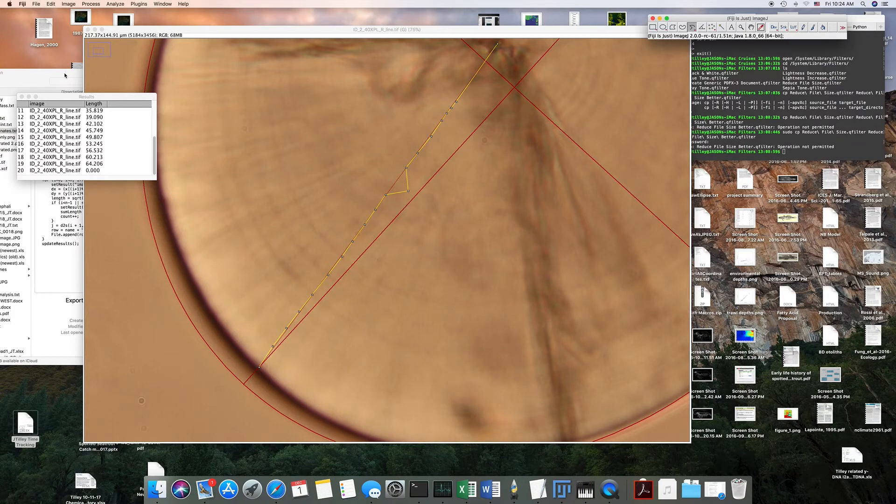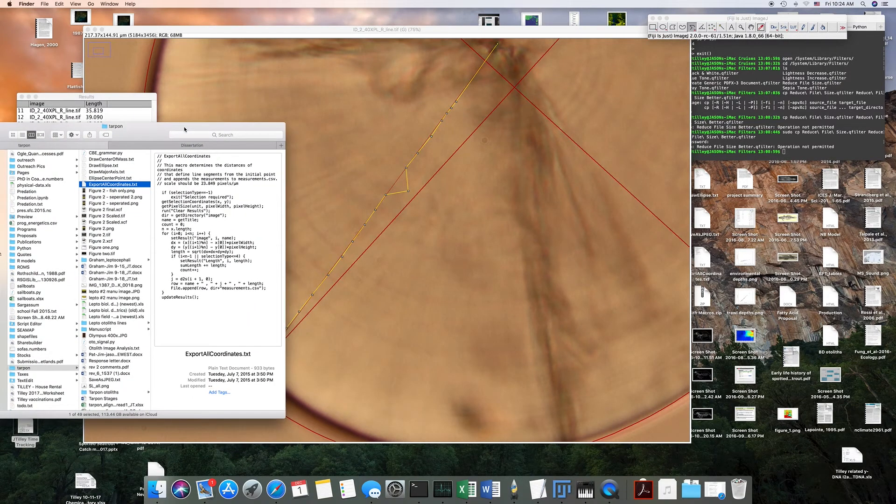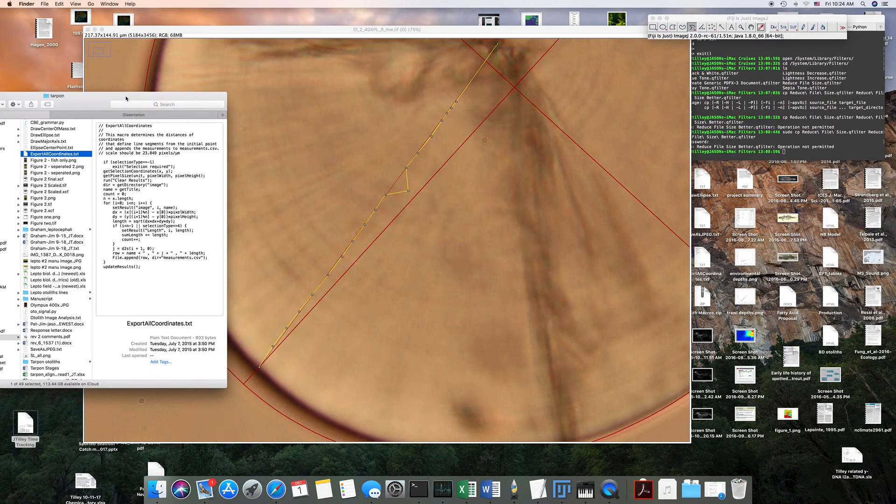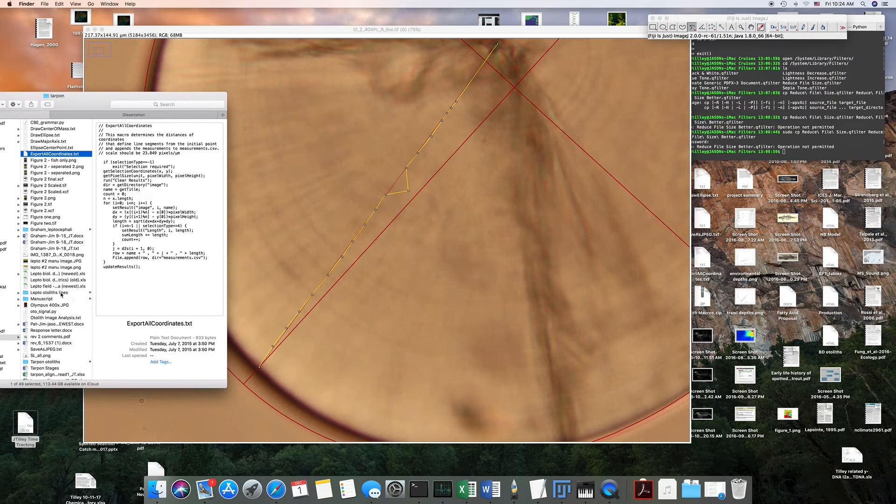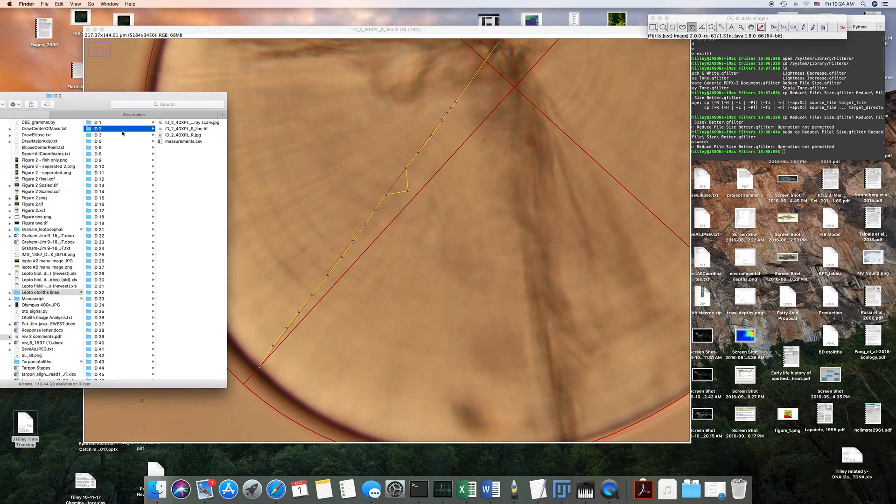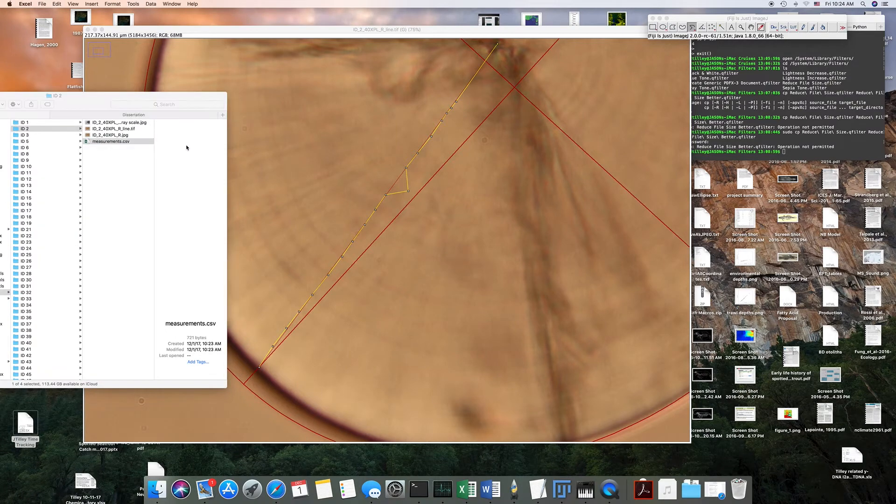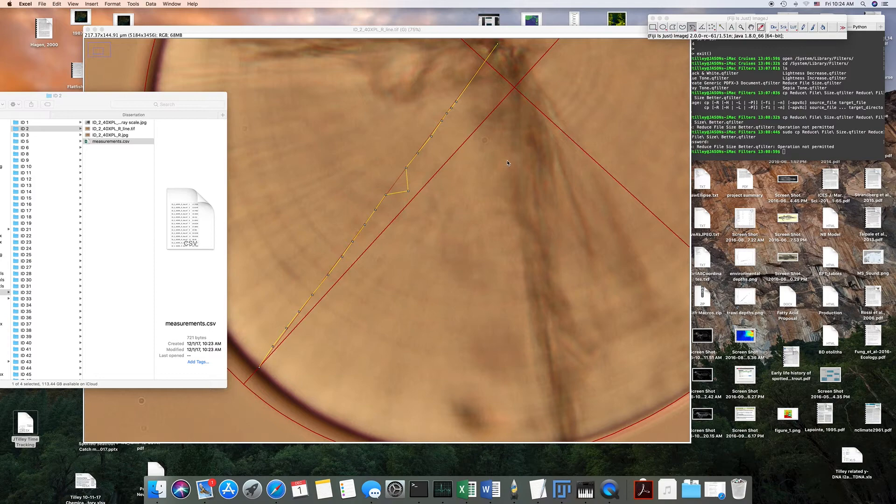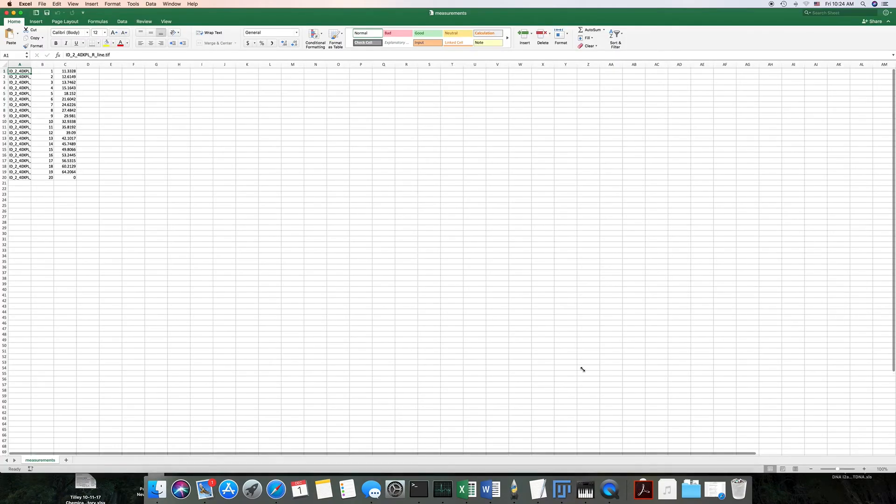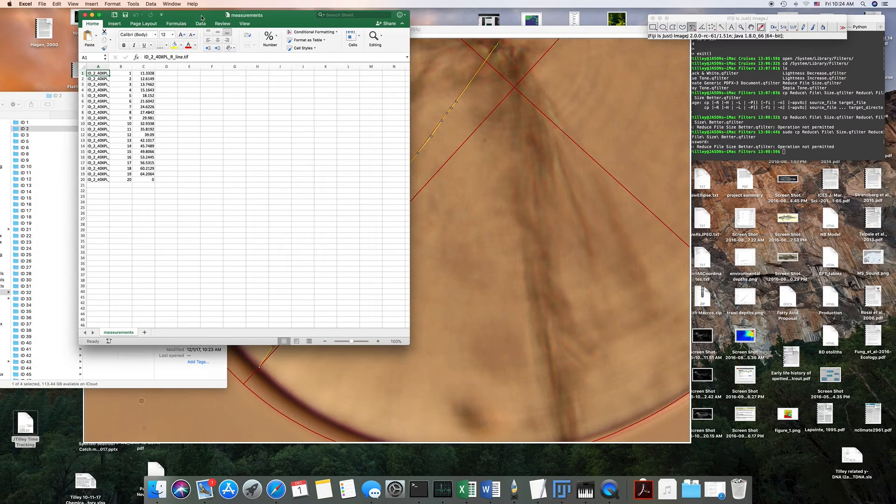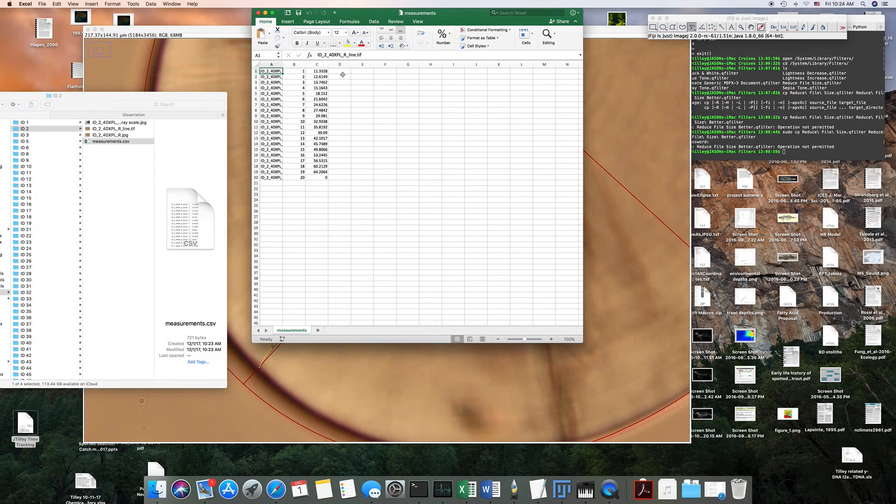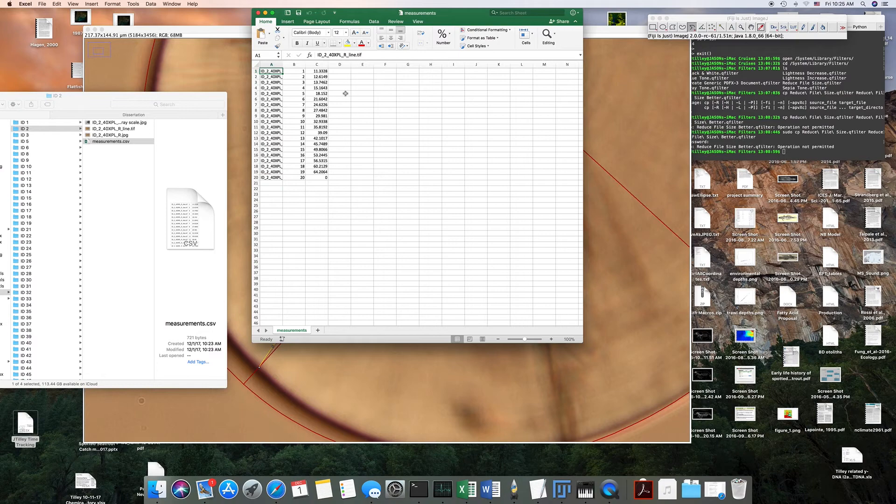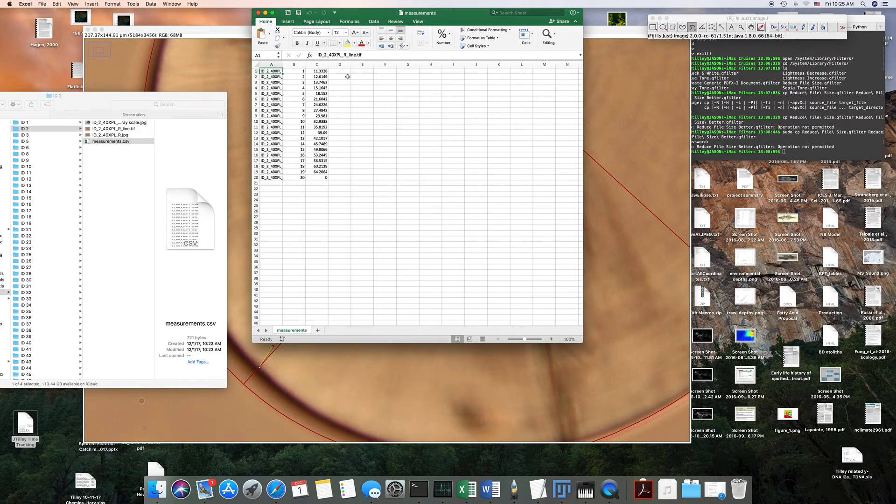So now I've got this file here. Each fish will have some file, I don't know what that's about, but here's the final data. And I've got a script that can take multiple files and it'll merge them all into one file, transpose them, clean it up nicely. That's basically the gist of it.